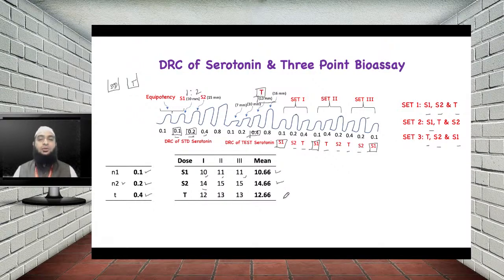Now what happens in case of the matching and interpolation bioassay? You are not repeating each test dose three times. So it could be possible that whatever response the drug is giving, since you are not repeating it with a change in the sequence, the height you received can be an error, or some erroneous reading. And since you are not repeating, the limitation is that in case of matching bioassay you have a very small amount of sample. Since very little sample is available, you cannot repeat the reading thrice.